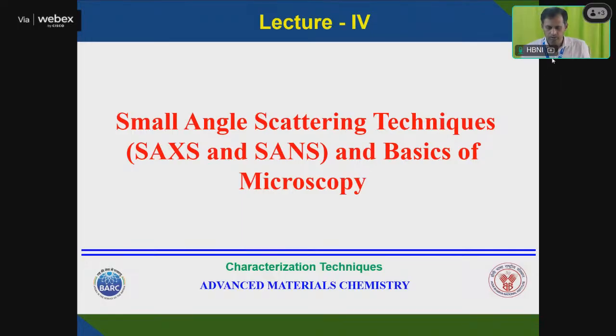Good afternoon. So in the last class we discussed X-ray diffraction techniques, X-ray absorption technique, X-ray fluorescence, as well as grazing angle XRD. Those are basically based on X-ray diffraction techniques. Mostly we use powder XRD for powder samples.